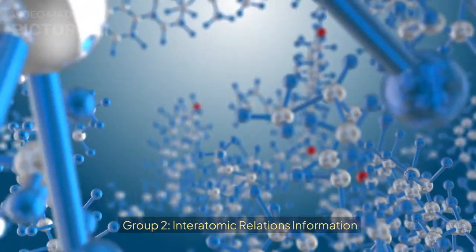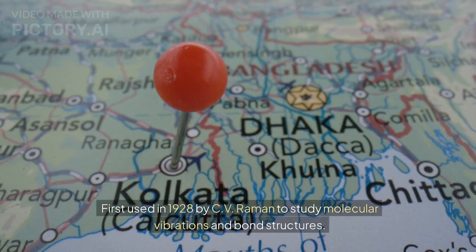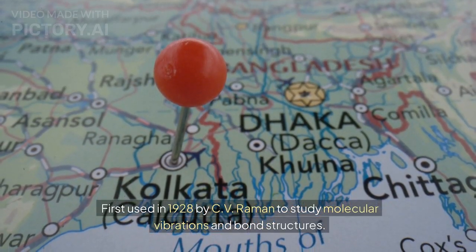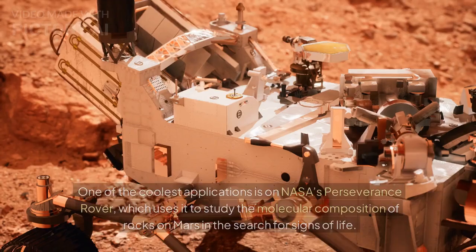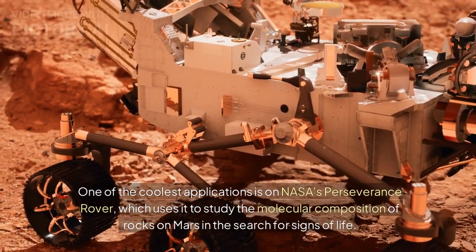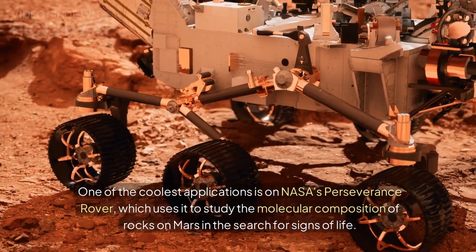Group 2. Interatomic Relations Information. Raman Spectroscopy, first used in 1928 by C.V. Raman to study molecular vibrations and bond structures. Handheld Raman systems are available for as low as $3,000 to $5,000. One of the coolest applications is on NASA's Perseverance rover, which uses it to study the molecular composition of rocks on Mars in the search for signs of life.